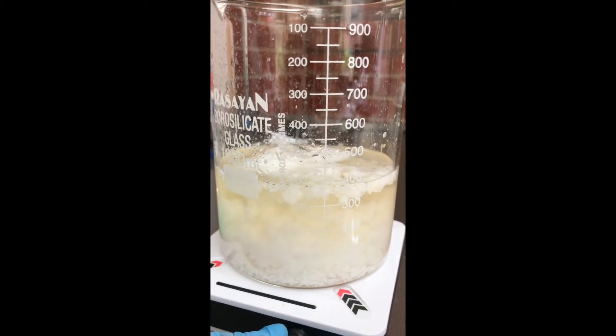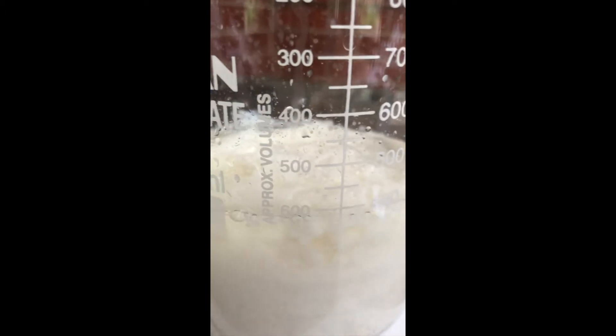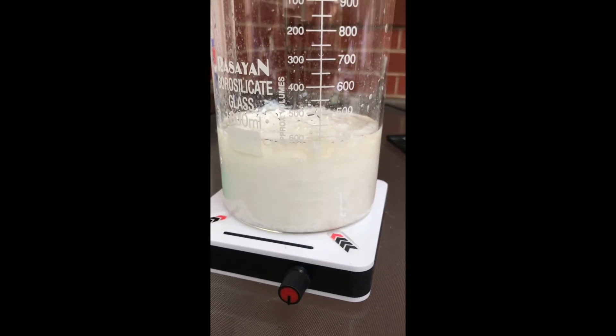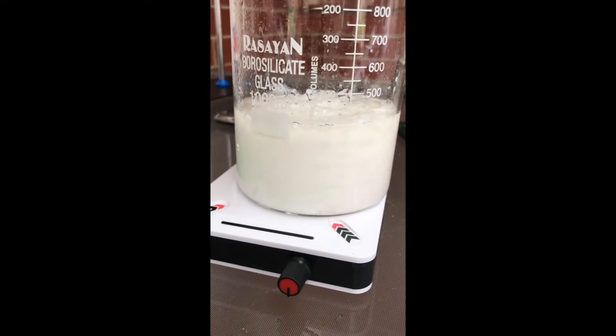One of the compounds you can see forming is calcium hydroxide. This is the white clumpy looking compound that precipitates as a solid out of the solution. The other compound is sodium acetate which is highly soluble and remains in the solution.